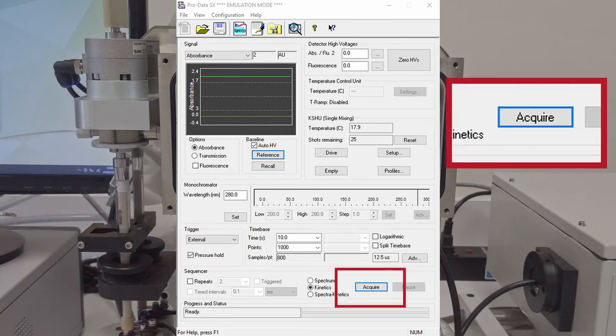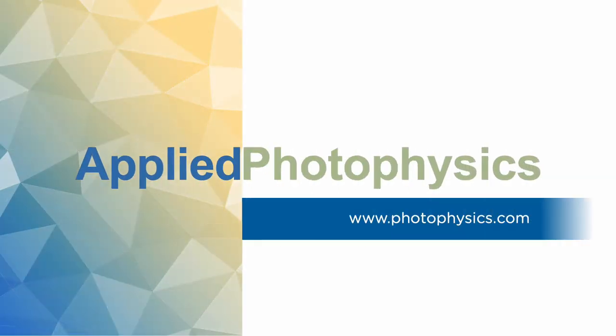If everything is done correctly, you should observe regular syringe behavior and no apparent leaks. Thank you for your attention.